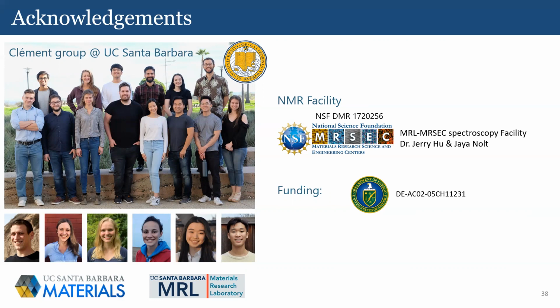Okay, I have one. If I am doing battery research and I want to learn about the structure of my material, my go-to is X-ray diffraction. I can do X-ray diffraction and learn about the structure. Why then would I go towards NMR to learn about my structure?